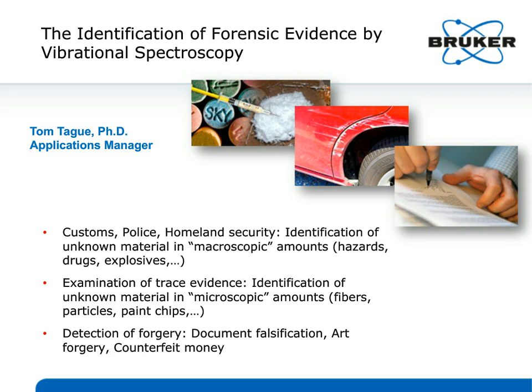Thank you. Well, I'm glad to be able to talk with you a little bit about using vibrational spectroscopy for examining forensics evidence. So one of the first questions that comes to mind when discussing forensics analysis is which tool works best, which means you need high sensitivity and high specificity. There are many tools at your disposal in a typical forensics lab. Which tool is best? In my opinion, you have to look at the evidence and say, do I need a high level of specificity or do I need that high level of sensitivity?